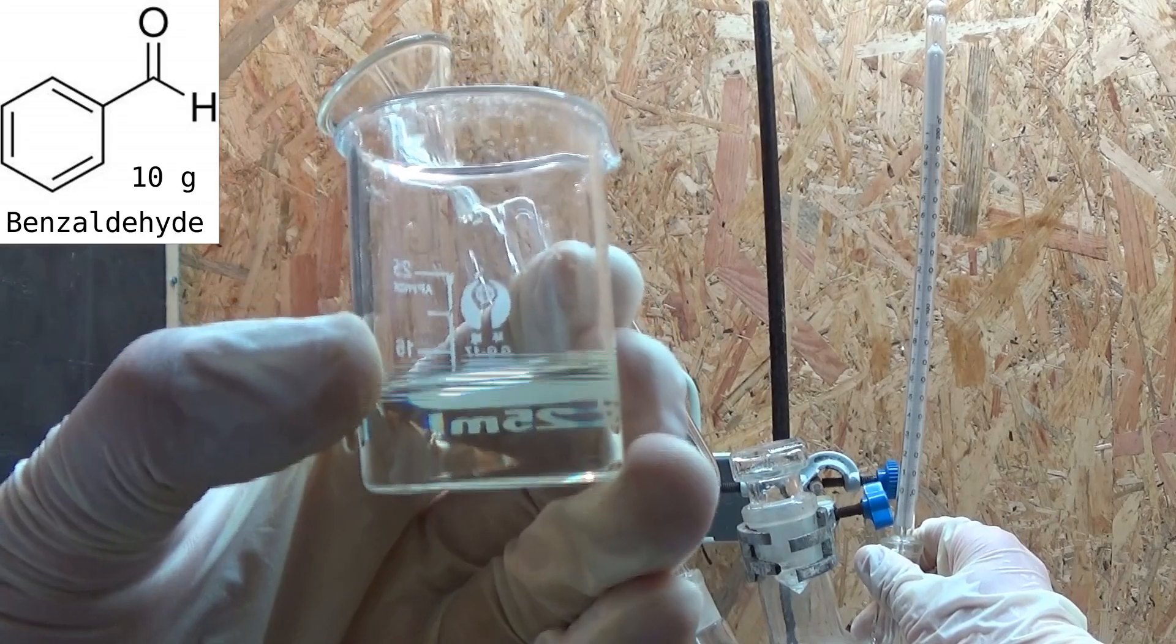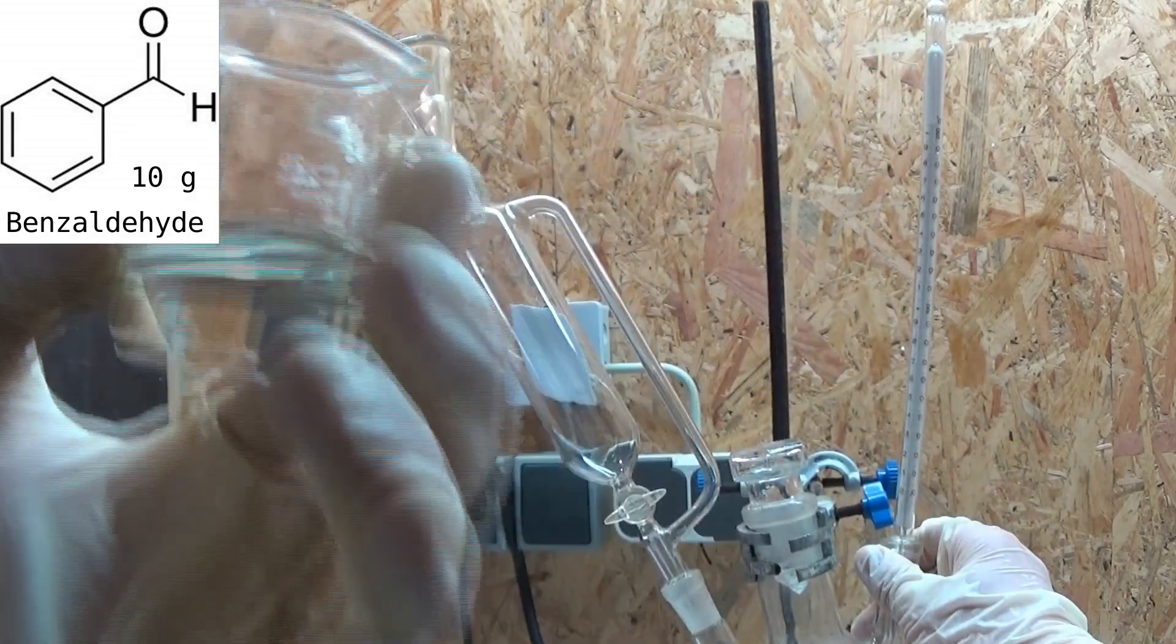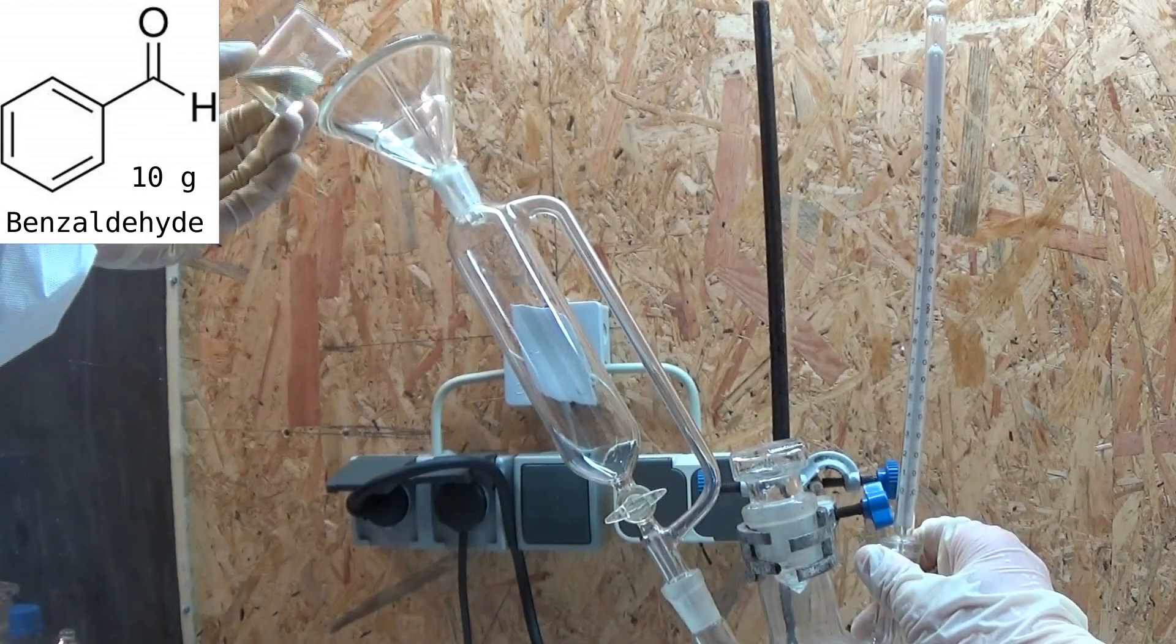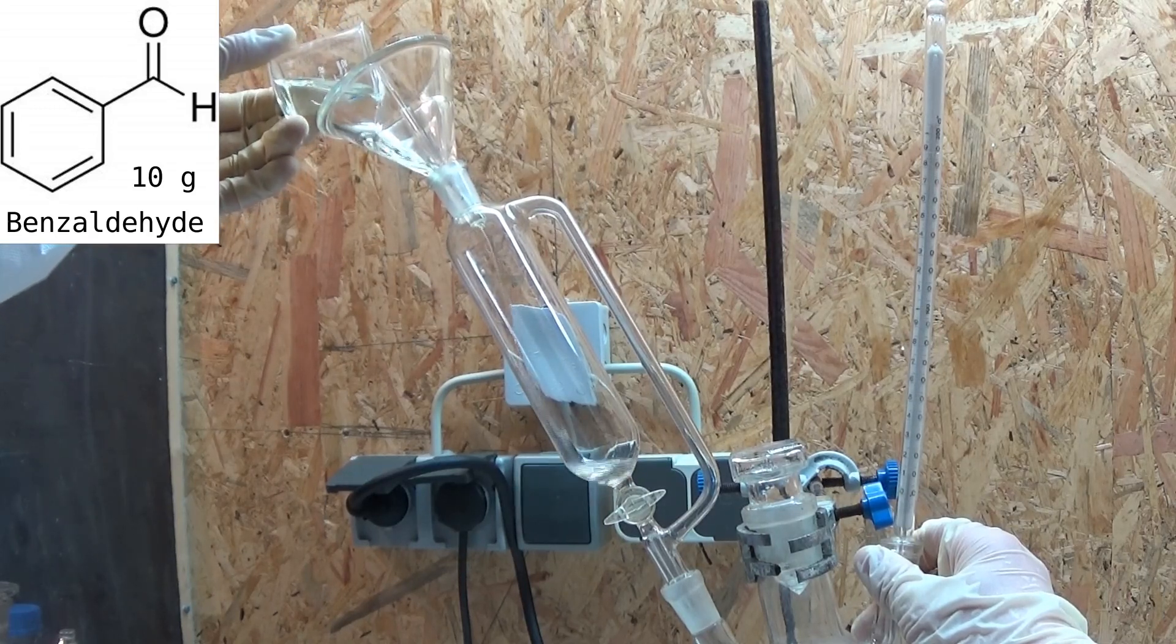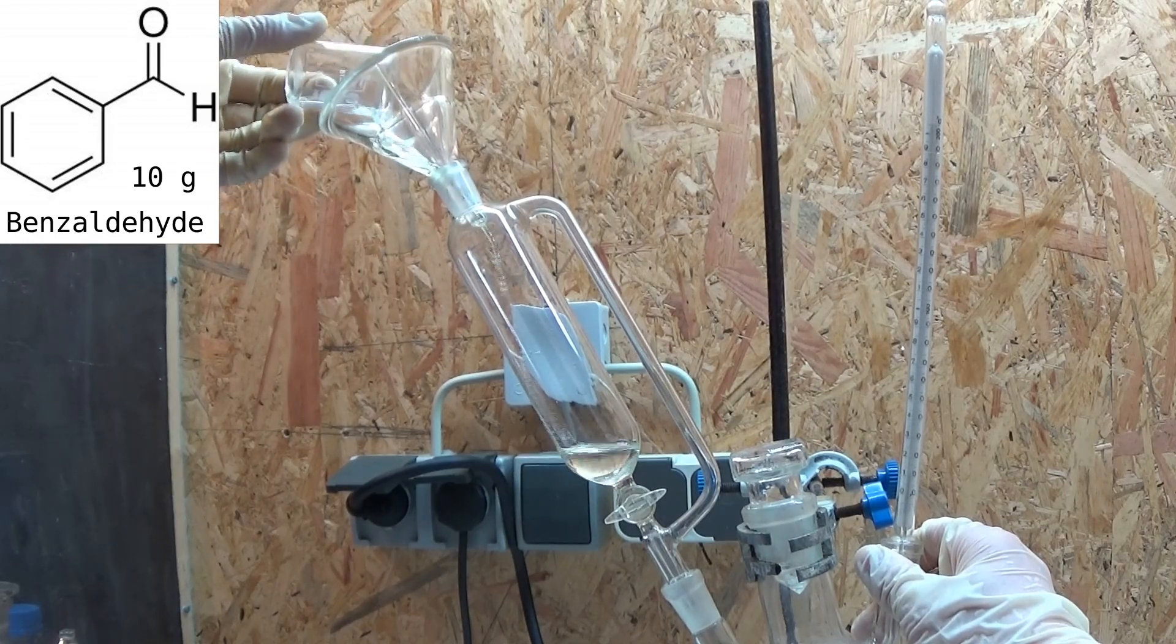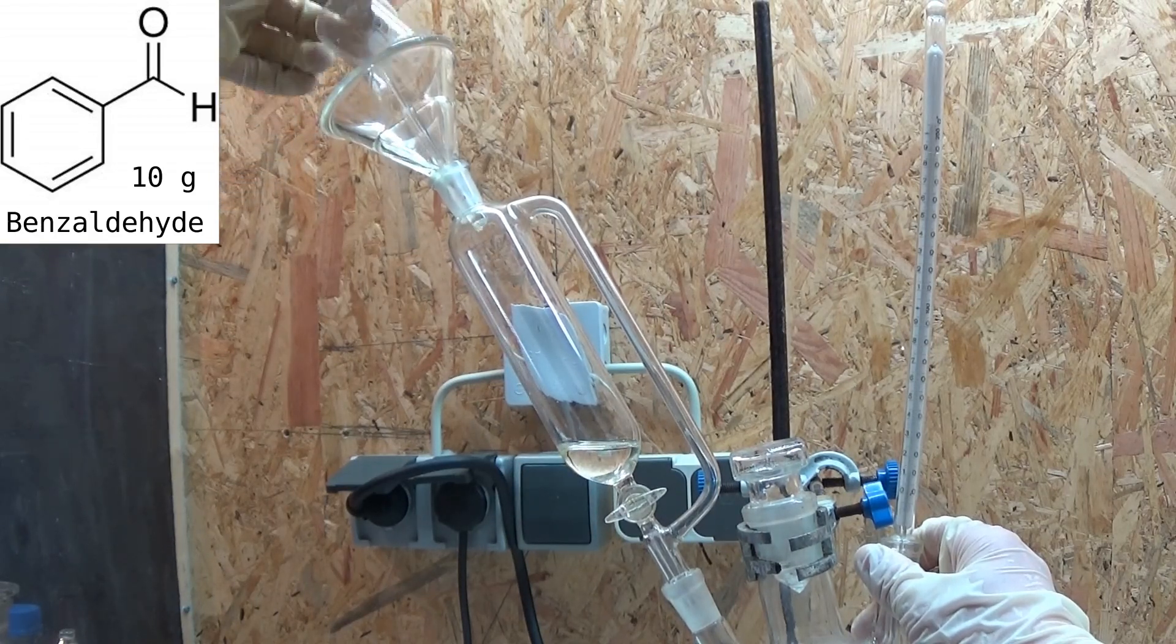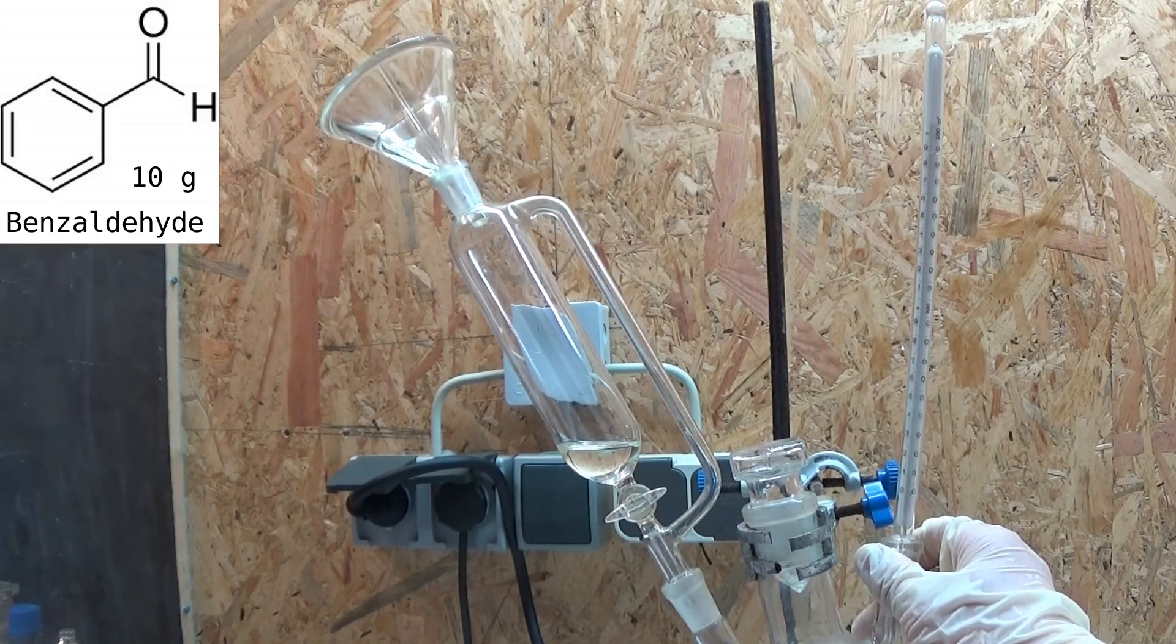After the addition of the sodium is done we place 10 grams of freshly distilled benzaldehyde in the addition funnel. It has to be freshly distilled because benzaldehyde auto-oxidizes with oxygen from the air forming benzoic acid which contaminates the benzaldehyde. This benzoic acid dissolves in the benzaldehyde making them inseparable without distillation.